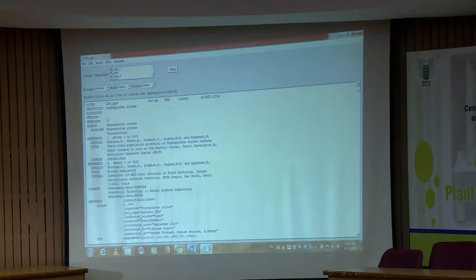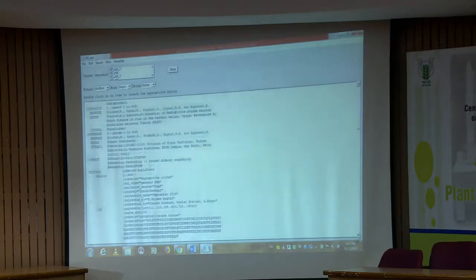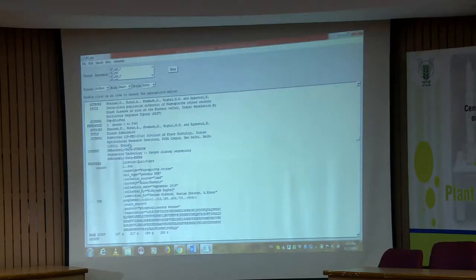This is the date, this is the organism name, these are the authors, this is the title of the study, right. Then how many bases it recognizes itself, then what technology you used, which was Sanger's technology. Then you go down, this is again regarding whatever information I was telling you now, that you keep it ready in some document and keep on copy pasting it. You do not have to waste time, you cannot do everything on the spot, so keep things ready and keep on copy pasting.